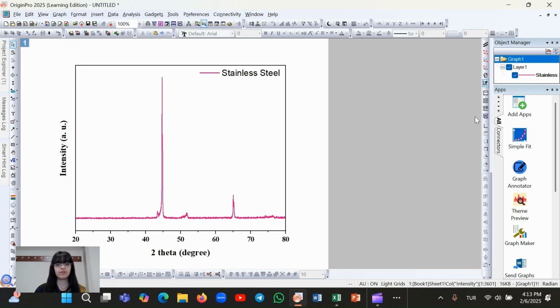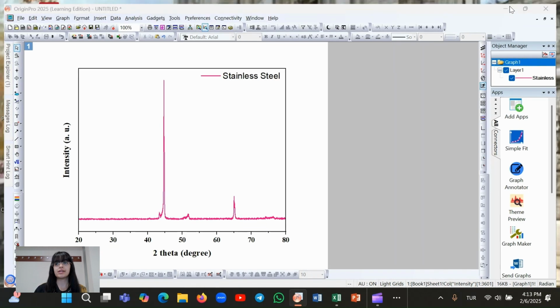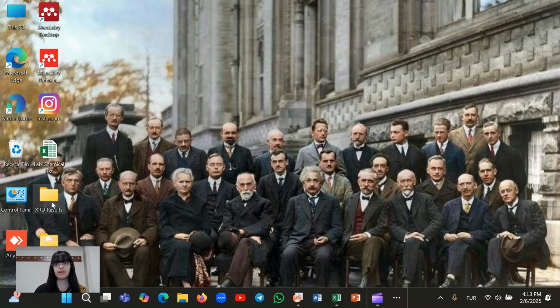Okay. Now I want to open the ICDD file of our PDF card.